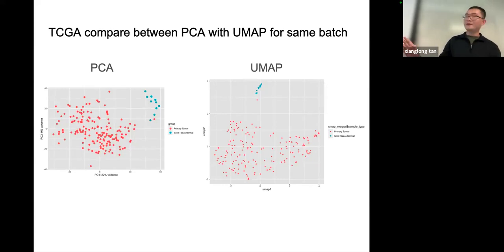Even though PCA has lower resolution compared to UMAP, for a very simple QC or quality control check, the control samples should always cluster together, with the same trend as the UMAP shows.